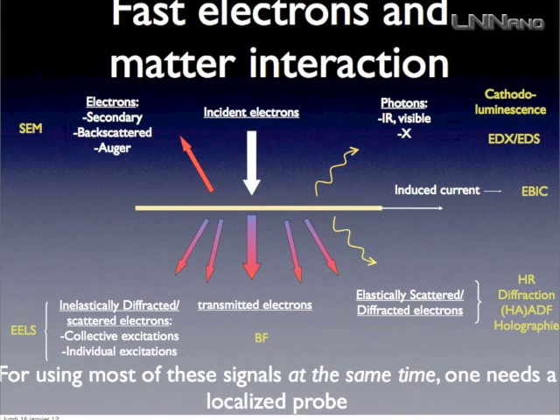Okay, so what you do in a standard TEM experiment is that you send an electron beam, which is typically 100 kilovolts. The speed is typically half the speed of light. And you send it onto a sample, and these electrons will interact with the material of interest. There are many ways it can interact, but the first one is that it will not interact. So this is the transmitted beam.